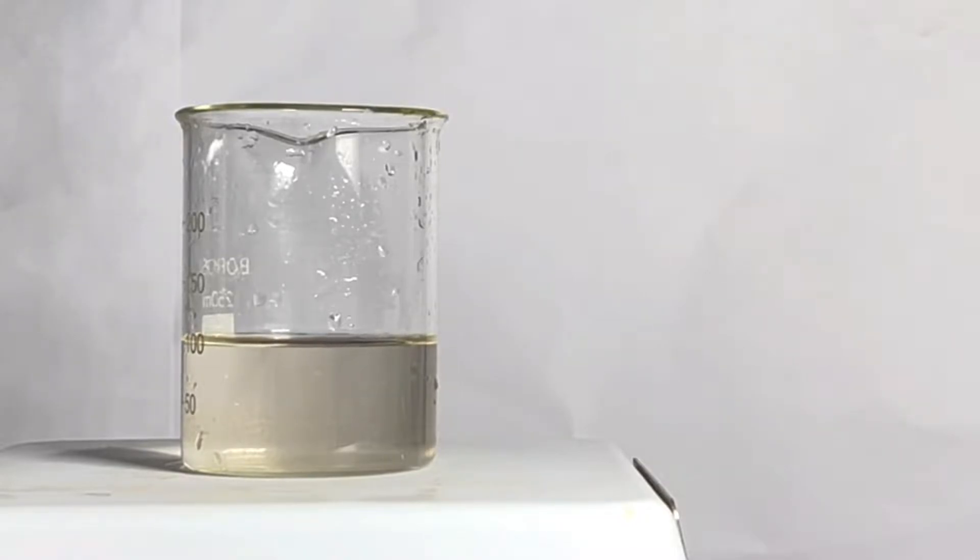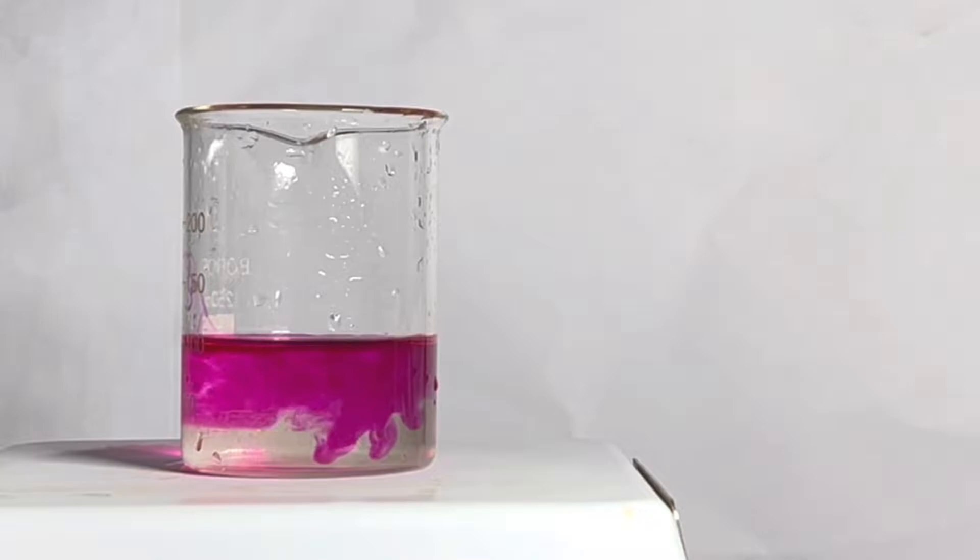Phenolphthalein is a very commonly used indicator in chemistry and is mainly used in acid-base titrations. It turns colorless in acidic solution and pink in basic solution.